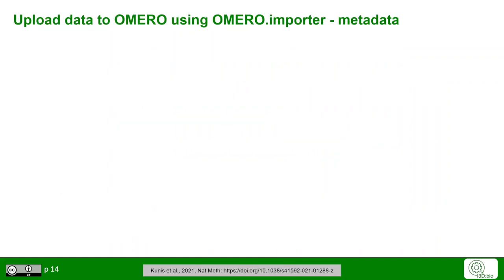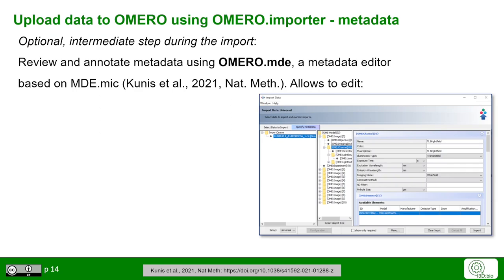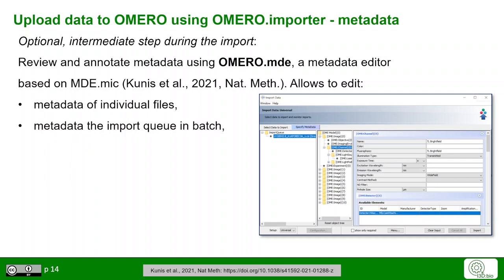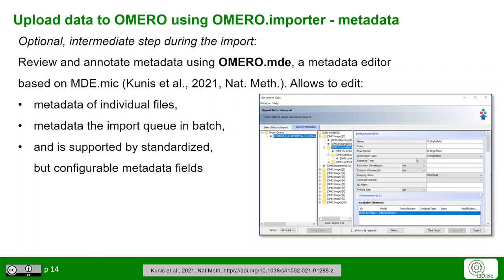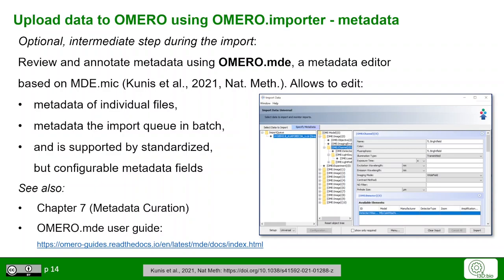Let's have a look at the metadata again. If we use the optional intermediate step during the import — Omero MDE — we can call up different metadata fields according to specific metadata formats and schemes. Please review the original paper on this, shown at the bottom of the page. Here we can edit the metadata of individual files or of the whole import queue in batch. This supports standardized, configurable metadata fields and even ontology call-up. We will go into more detail on metadata curation in later chapters.